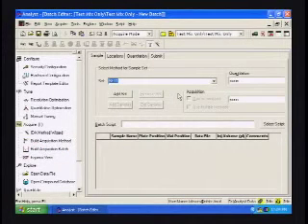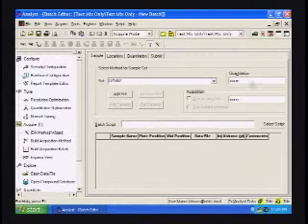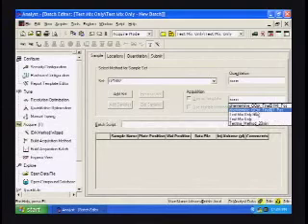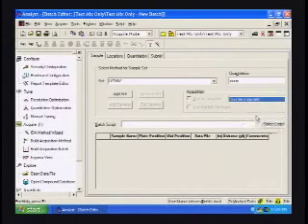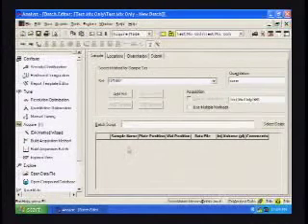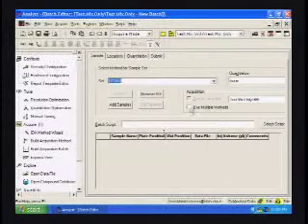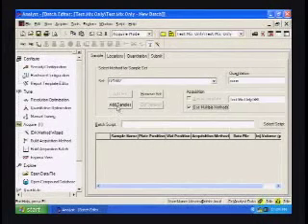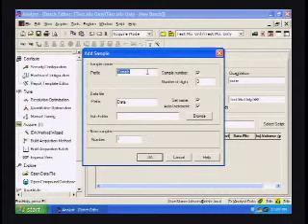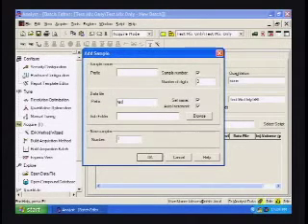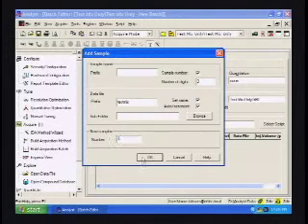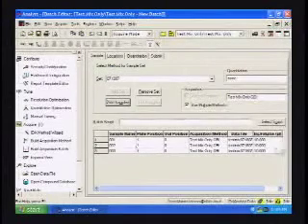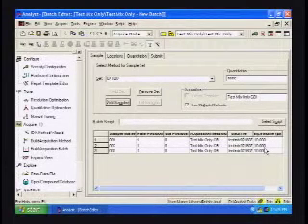Again, we'll put the date in there. We'll select the method, add set, and let's do multiple methods just to demonstrate that, and add samples. Call this test mix, and we're going to do three samples. This time the injection volume is correctly set at 10 microliters.